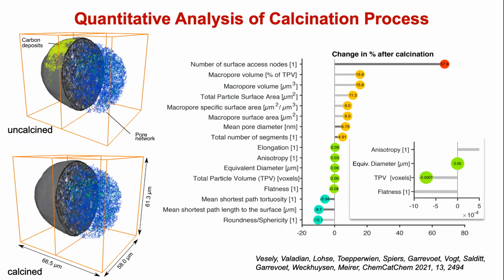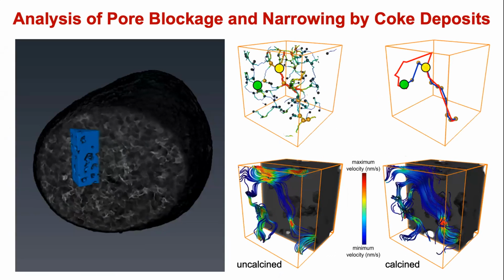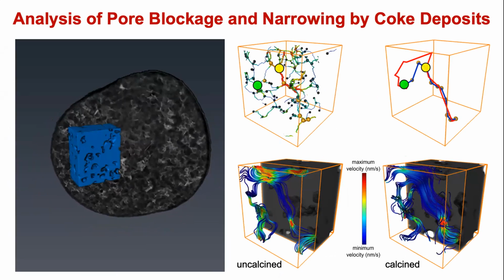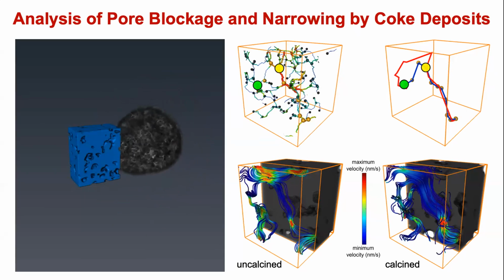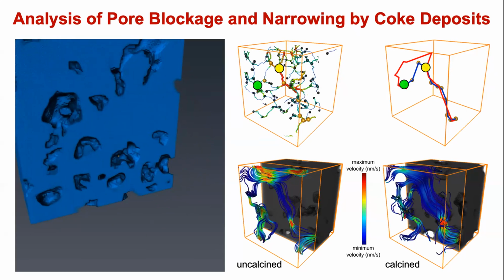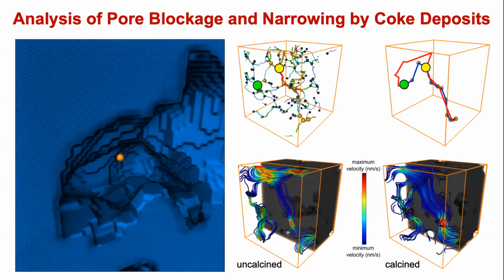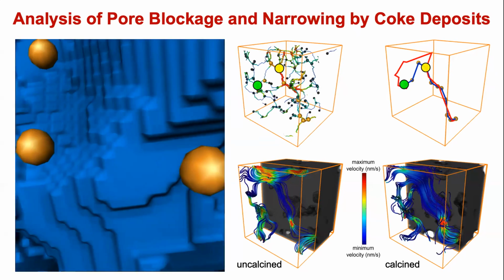What you can do is you can measure the carbon deposits, a lot of parameters you can measure, and I hope still that this works. So this works, yes, great. And now what you can do is you can know where the carbon is. So this is a volume which we take out. And here I show you that when you go through it, I hope it will work now, that you can note in 3D where carbon deposits is.